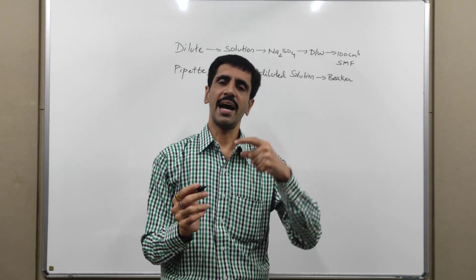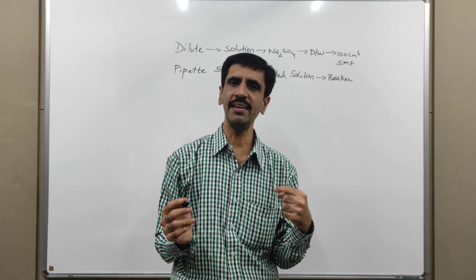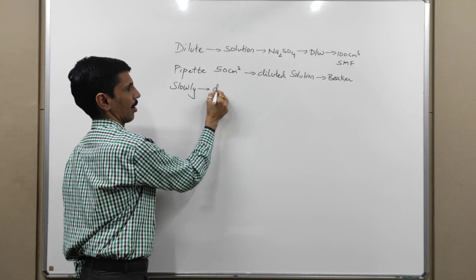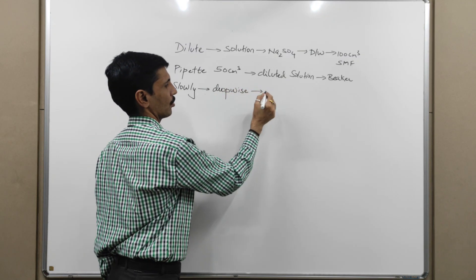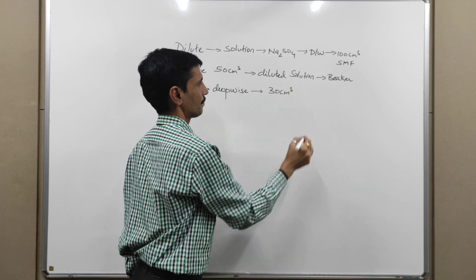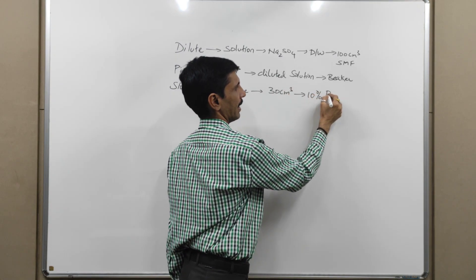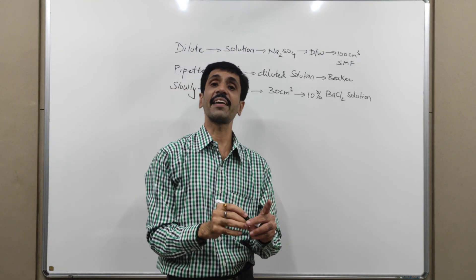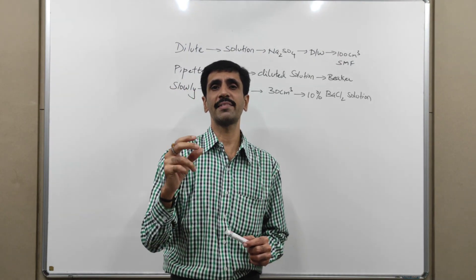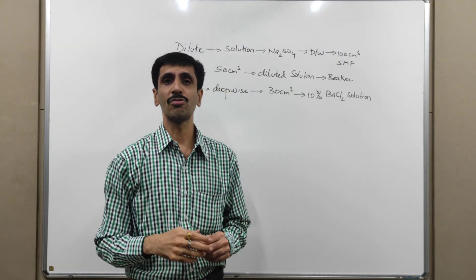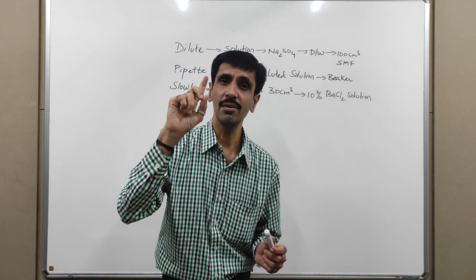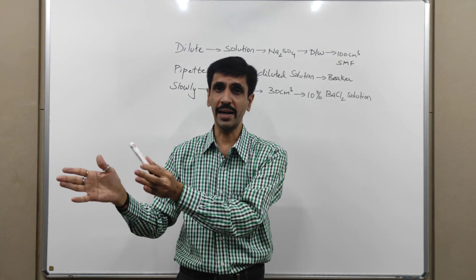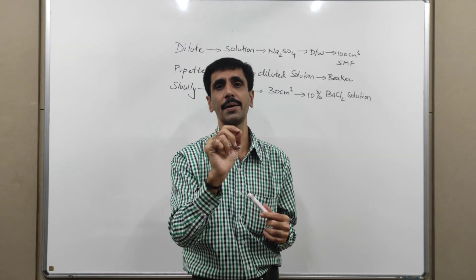The given sodium sulfate solution needs to be converted into a precipitate. Very slowly — dropwise — we are going to add approximately 30 cm³ of 10% BaCl2 solution, with constant stirring. The reaction which takes place is sodium sulfate plus barium chloride, which results in a white precipitate of barium sulfate.